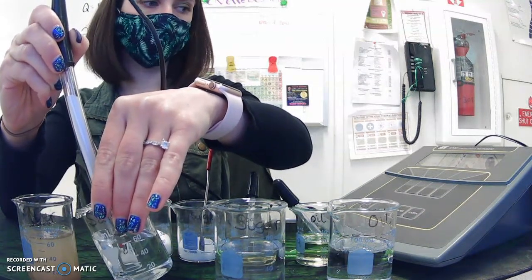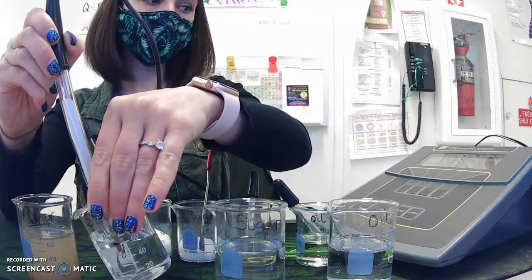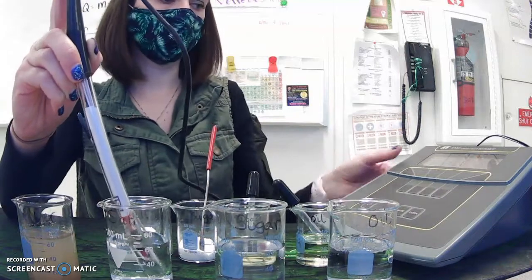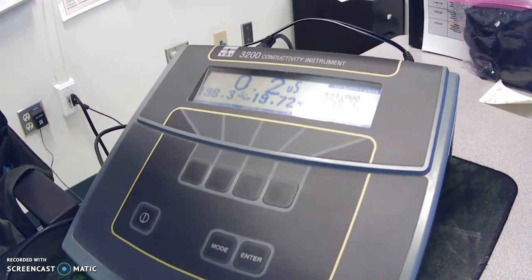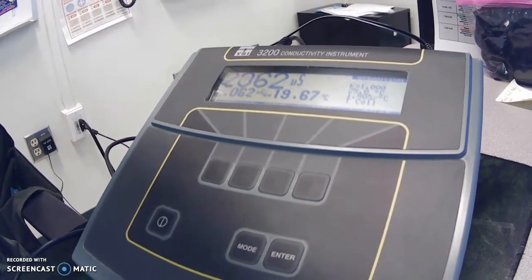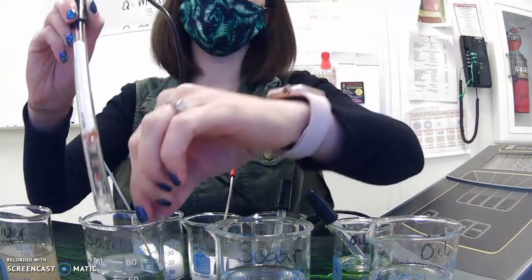It's changing frequently. So that's 7.5. There's some charge that's popping up, 0.99. That's measuring the electricity that's running through it. Since there's not much salt in here, it changes pretty quickly. So it's measuring the conductivity within this salt solution.